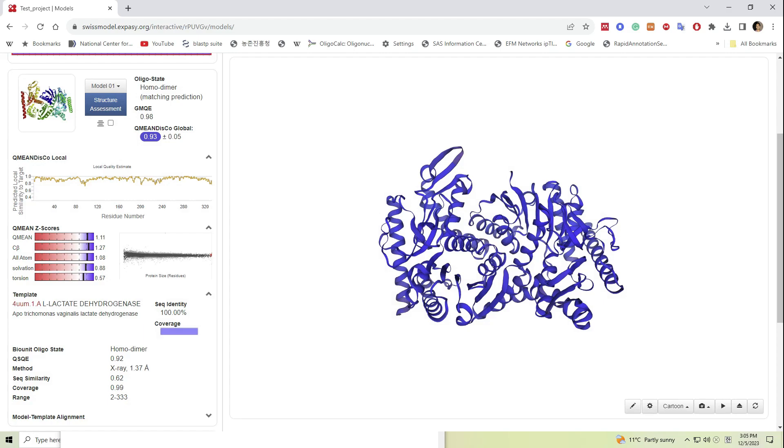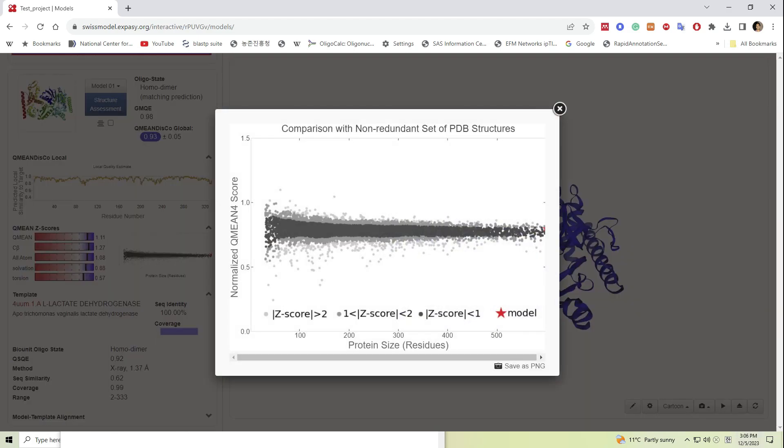Another important plot is the QMEANDisCo plot. Here our model falls into the darker region of the plot. That means the model is highly reliable than if it falls into the gray color zone.